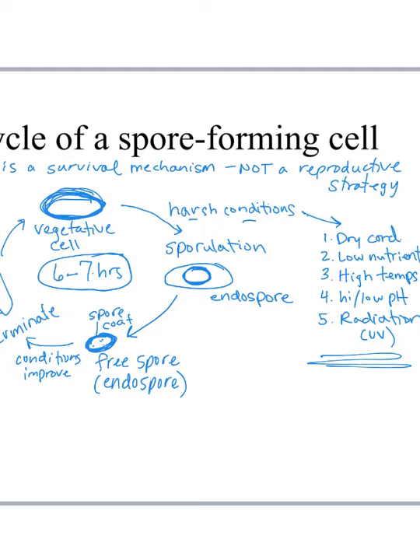Okay, just noticed. Let's say spores are a survival mechanism. That sounds like better English. Let me just fix that there. There, all right, I'm a little more satisfied there.